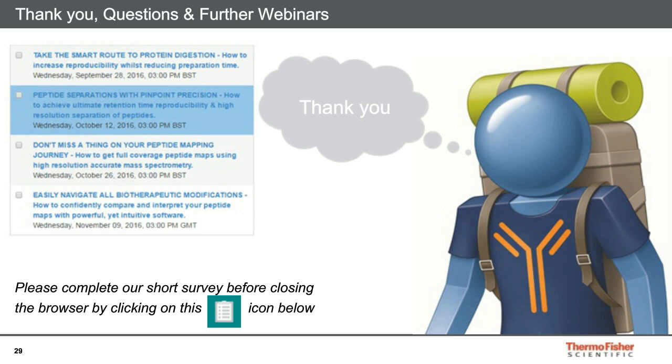One last final question from Algorithm Farmer. What is the difference in scan rate of the Q-Exactive HF compared to the Orbitrap XL? I can take this one. The Orbitrap XL is already quite an old instrument, more or less the first Orbitrap instrument. The difference in scan speed is more than a factor of 10. The Q-Exactive HF is more than 10 times faster compared to the Orbitrap XL.